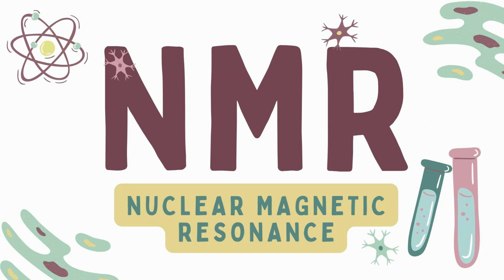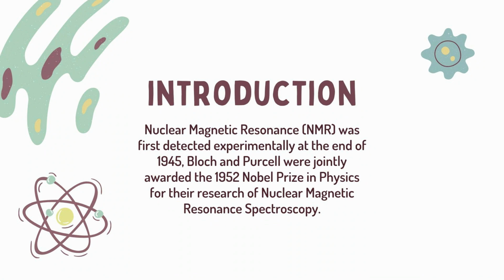We are going to know about NMR lab safety. Introduction about NMR. Nuclear magnetic resonance, NMR, was first detected experimentally in 1945.